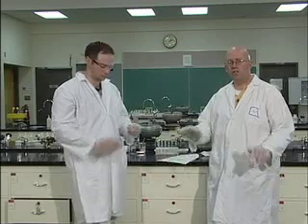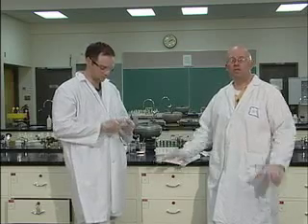Lots of observations in this lab. Do things slowly, methodically. Make sure you're comfortable. You know your tables. Make sure you're making lots and lots of observations. Any final parting shots?